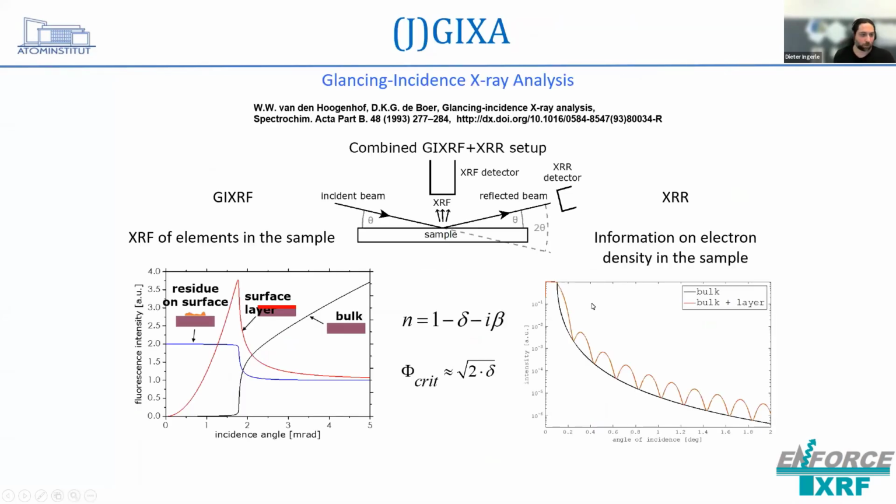Okay, so that brings us now to the final part, which is just some words about the evaluation part and also some examples. So again, if we go back, think about how we can evaluate or calculate these intensities. One of the important parts here is the effective index, which is connected, of course, to the critical angle also by the delta here.